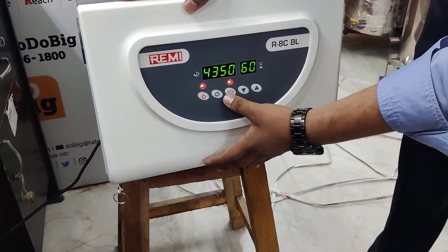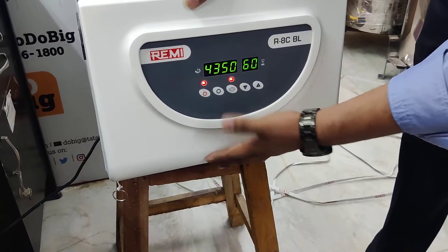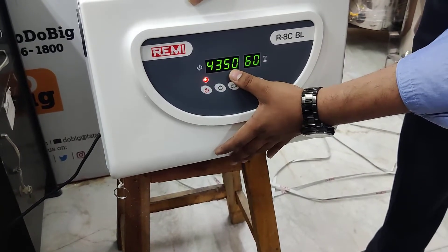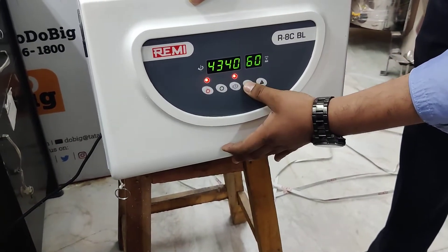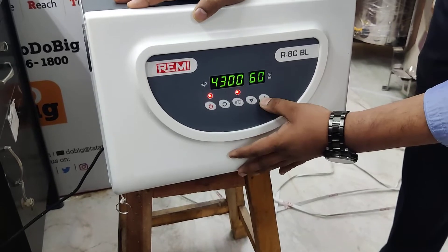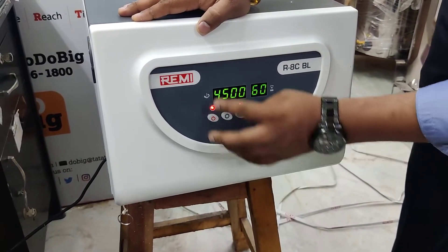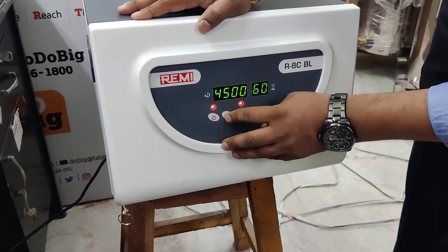Once you close the lid, you have to click on the anti-vibrating option. This always has to be in the red position. Then click on the setting option — the RPM indicator will start blinking. You have to increase or decrease the RPM. I am setting this RPM at 4500 RPM.